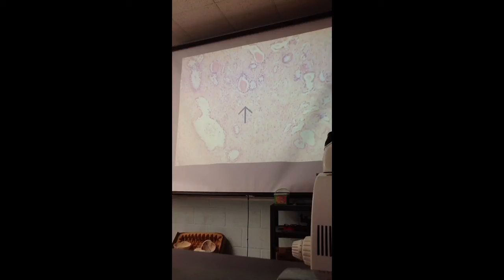When we look at the ductus deferens, a very narrow lumen but a very thick muscular wall. The epithelium in the reproductive tract is generally pseudostratified columnar. When you look at the epididymis, pseudostratified columnar epithelium, but the giveaway is stereocilia. You can see nice stereocilia inside the lumen. When you look at the testis, several layers of developing cells, that is the seminiferous tubules, and you can also look at the sperms in the lumen.